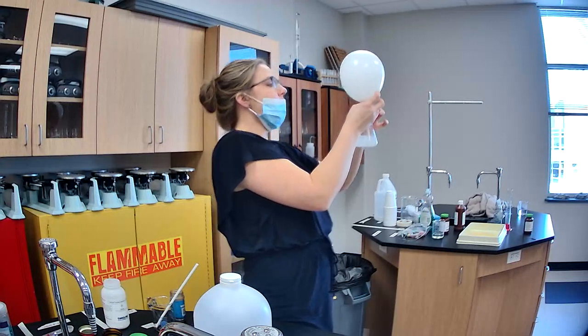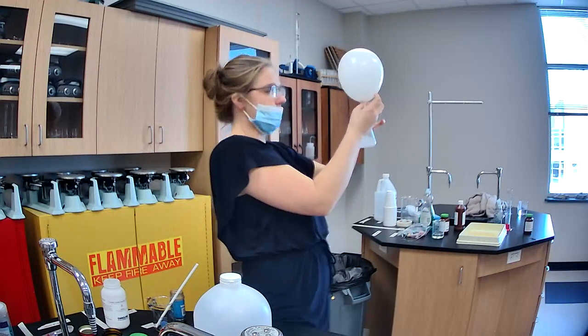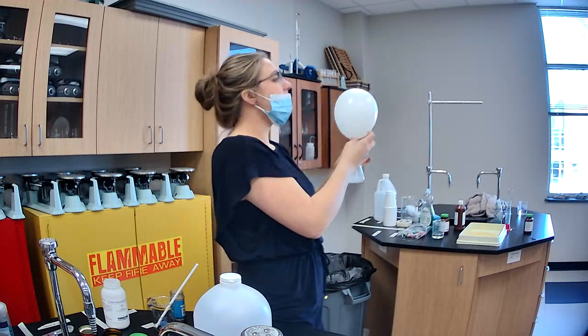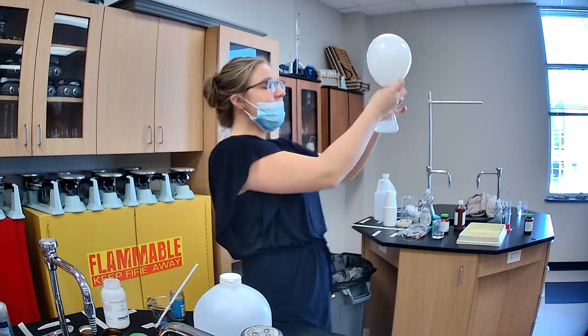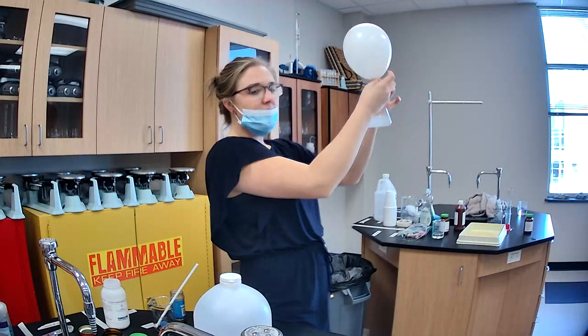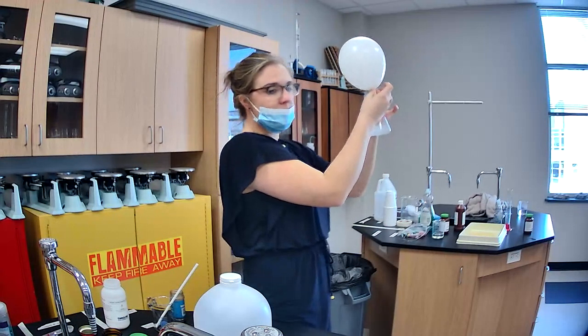One of the new chemicals, as it begins to decompose and break down, releases carbon dioxide gas. As that gas tries to escape from the flask, I'm trapping it in the balloon, which is what causes the balloon to expand and blow up.